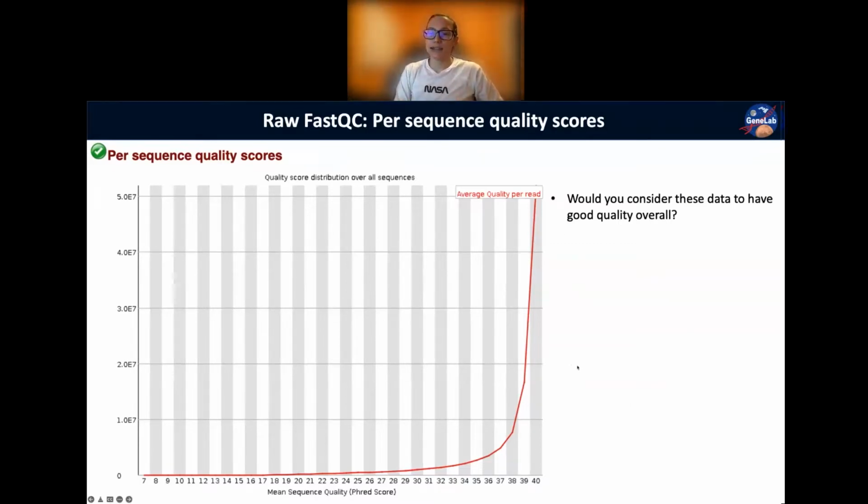And you tend to see that with Illumina. Again, there's a reason Illumina won. Their sequences tend to be really high quality. And if they're not really high quality, sometimes it can be an instrument glitch. And actually, at least in our experience, we have had that happen where we see something weird with the flow cell and the sequences coming off, and we'll actually contact Illumina. And oftentimes they'll replace a flow cell if something goes wrong with the machine, because usually we see quality that's this good from Illumina instruments.